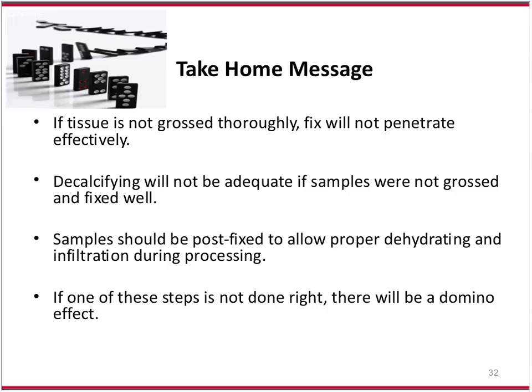That's why we've post-fixed all of our samples, and it allows proper dehydration and infiltration during processing. If any of these steps aren't done right, then you have the domino effect.